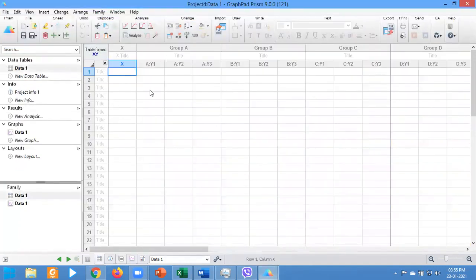This will provide you this dialog box, and this is for one extract. For example, this is for catechin. This is for crude methanol extract. This is for ethyl acetate fraction, and so on. You can calculate multiple data in this table.